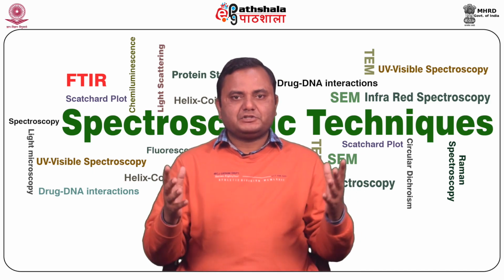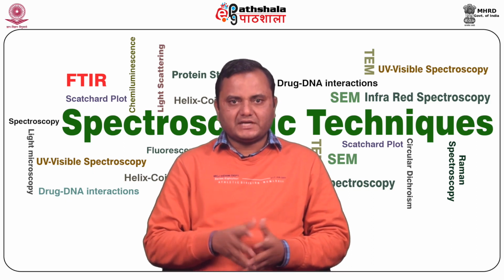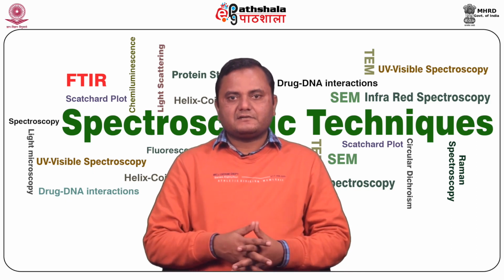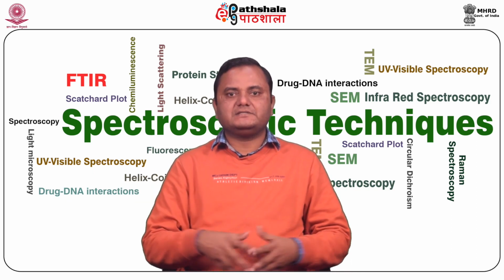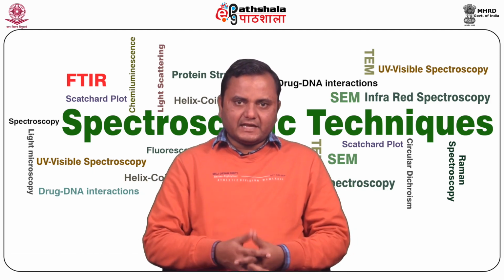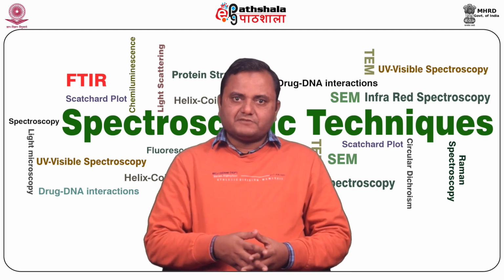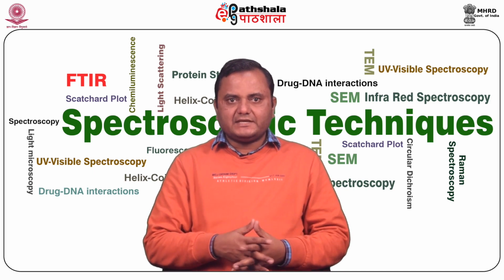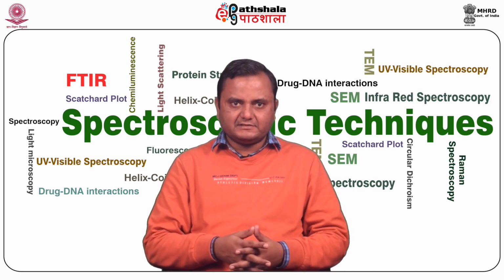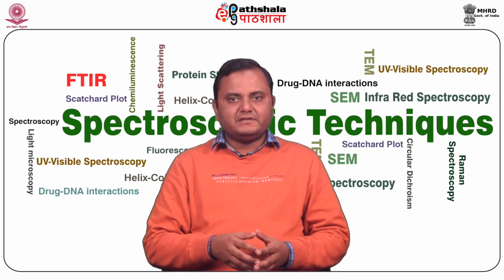When the excitation light impinges on the sample, molecules in the solution are excited and some of the light is emitted, and the emitted light is at a right angle to the incoming beam. It is analyzed by the emission monochromator, which selects the light and directs it to the detector. The wavelength analysis of the emitted light is carried out by measuring the intensity of fluorescence at a pre-selected wavelength. The analyzer monochromator directs emitted light of the pre-selected wavelength to the detector.